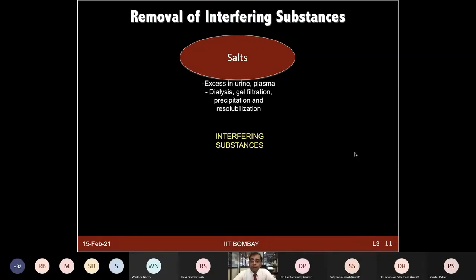Those are highly enriched in salt, and you have to remove that either by performing dialysis or different types of gel filtration methods, or even when you are doing the TCA acetone precipitation, sometimes that removes it very easily, and you can do subsequent washing steps. So many of these are the ways to remove your contaminations.